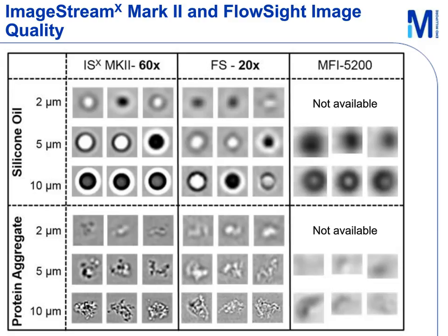In order to demonstrate this, we performed a simple experiment where we prepared samples containing silicone oil droplets or IgG protein aggregates and ran them on the ImageStream-X using 60x magnification, the FlowSight using 20x magnification, and the MFI-5200, which is one of the most popular flow microscopy instruments used in the industry today. Representative imagery for each particle type is shown for particles 2, 5, and 10 microns in diameter, where each image is scaled to the same size in order to evaluate its quality.